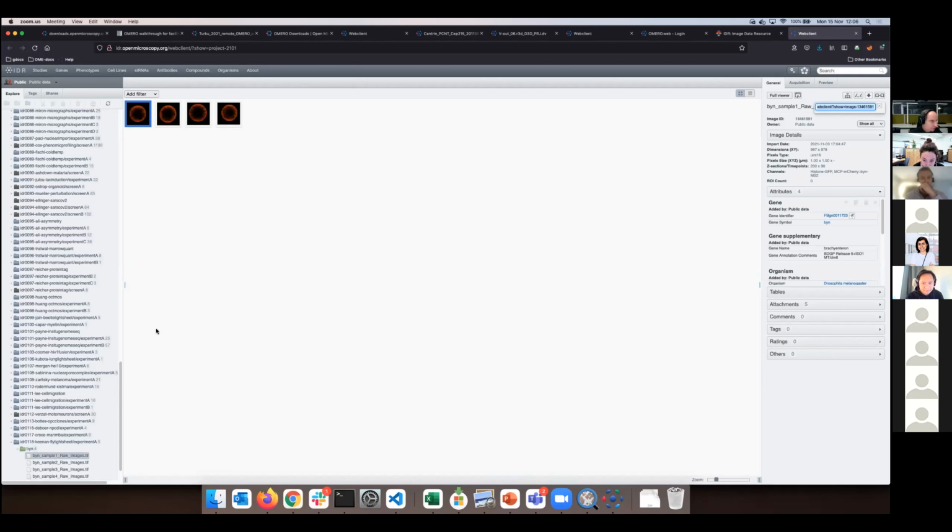Then I go into the Zoom chat like so. And now any one of you can click on this link, which looks suspiciously similar to the one which I pasted, for which you had to have credentials. But for this IDR link, you don't have to have credentials. Why? Because the IDR group is called public. You can see it. It gives a strong hint. And all the data in IDR are public.